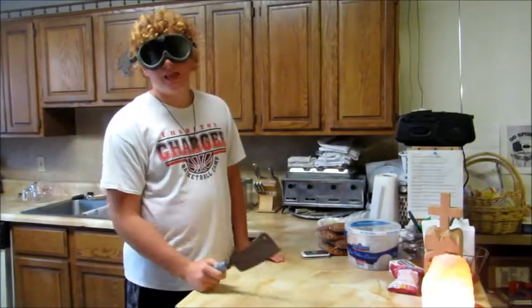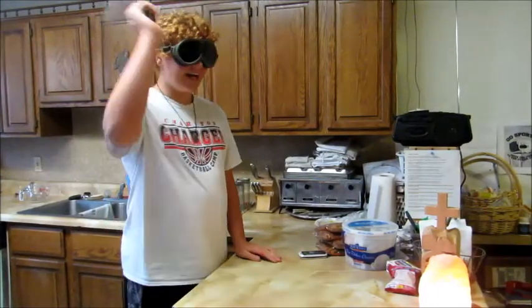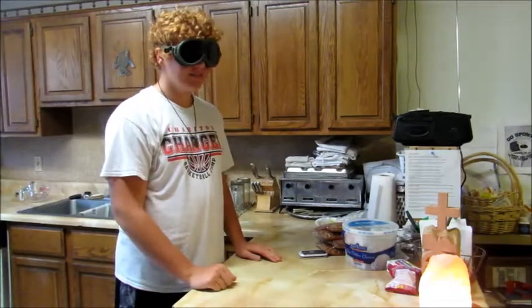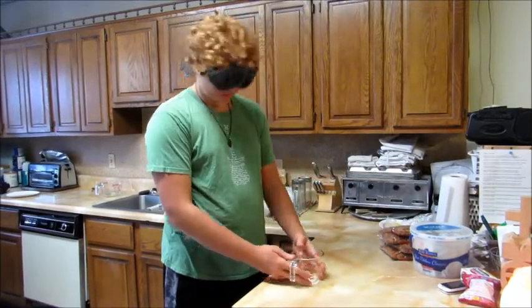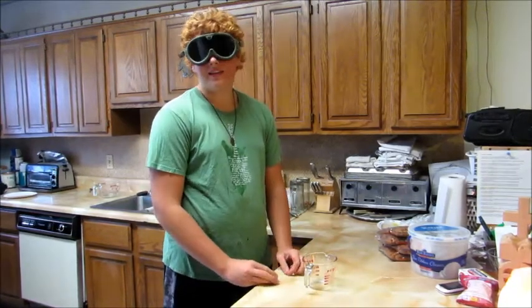Always be careful with blades in the lab. Hey, Tommy, catch! Always wear an apron so you don't get stuff on yourself. I didn't have an apron.